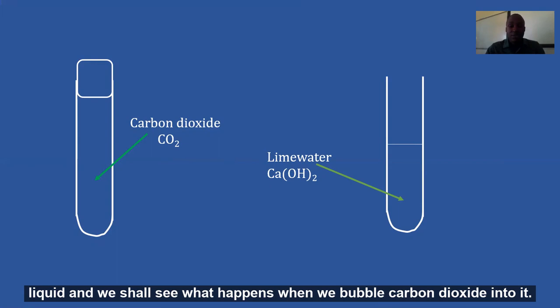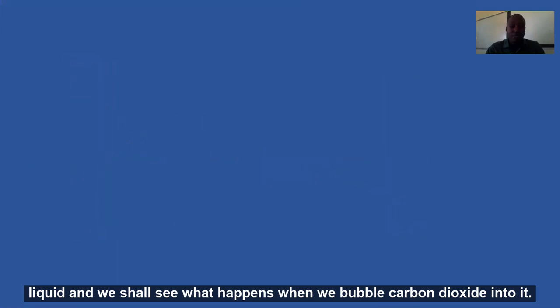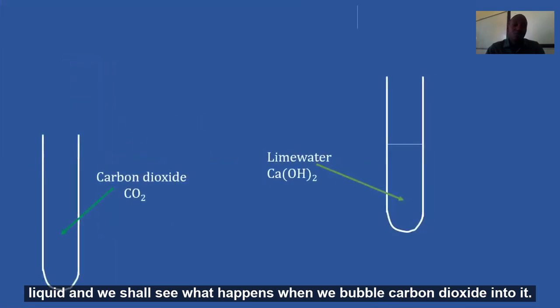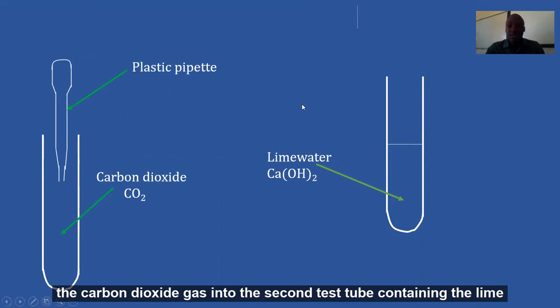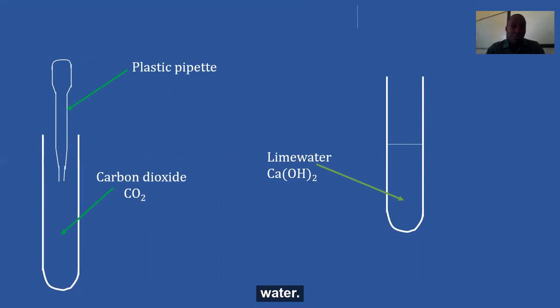So lime water is also a colorless liquid and we shall see what happens when we bubble carbon dioxide into it. We shall just need a plastic pipette to help us transfer the carbon dioxide gas into the second test tube containing the lime water.